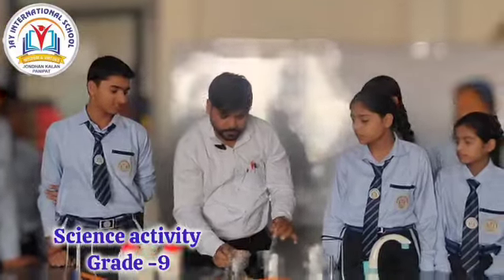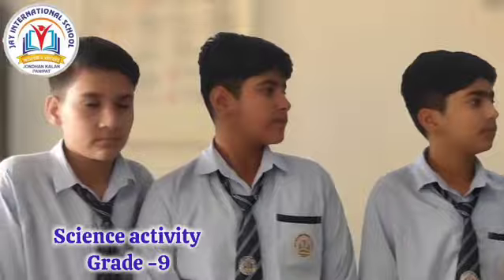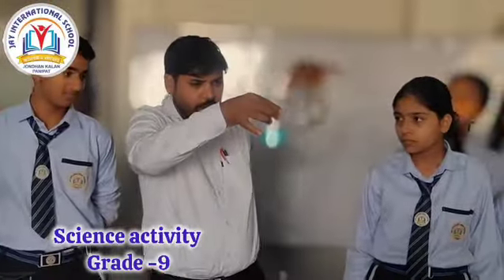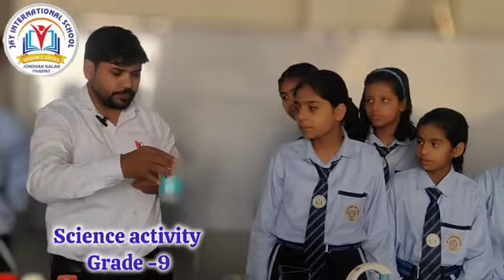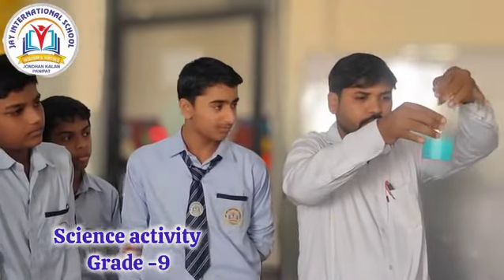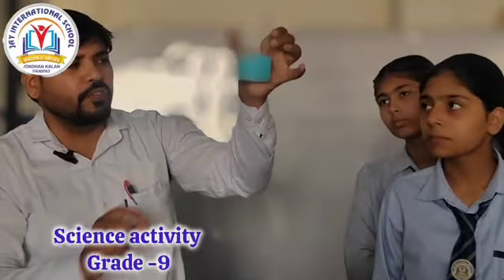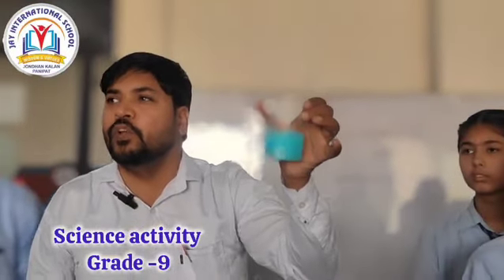Thank you, student. If I add water in this beaker, what is the color of this solution? Which salt did we add in this beaker? Copper sulfate, blue vitriol.